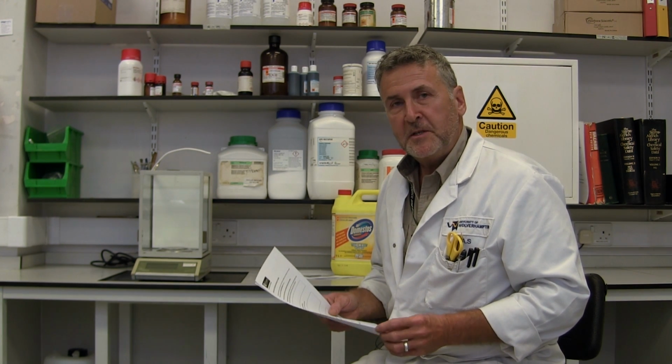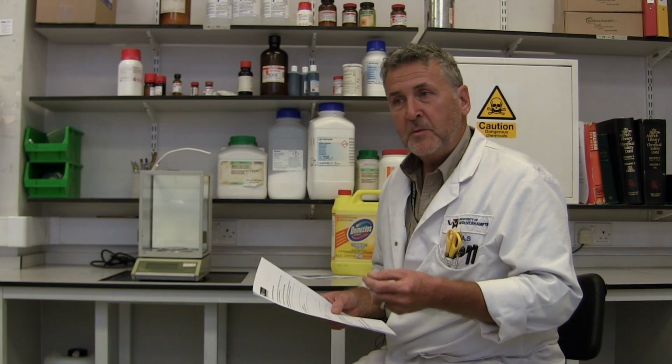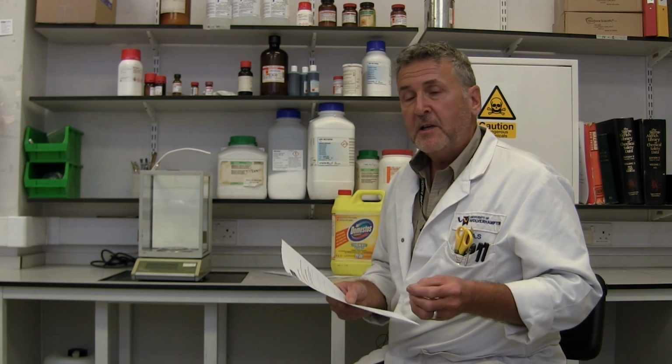On a system of online data and cut and pasting, why can't I just do that? We found in the past, when we have run a cut and paste system from online data sheets, that students tend to cut and paste huge chunks of information from the data sheet straight into their COSHH form. This has 2 problems. Firstly, you'll cut and paste a lot of information that isn't relevant because you're using small quantities. Secondly, you don't actually read it. What you'll do is get first aid measures, cut and paste, stick it in. You don't actually know what to do if you spill it on yourself.